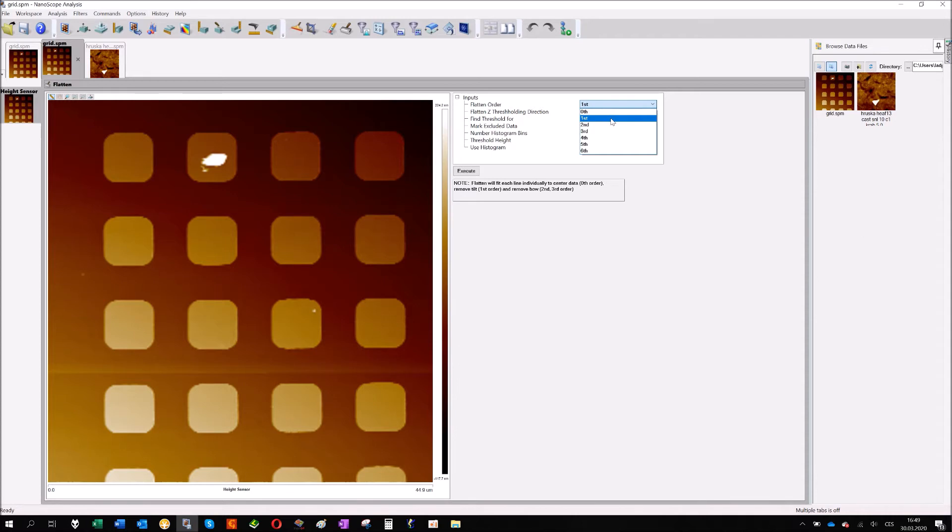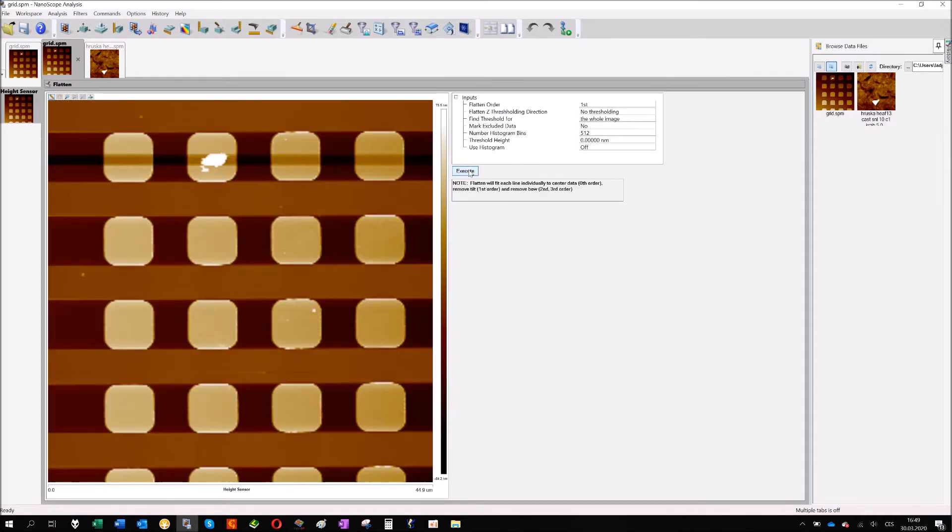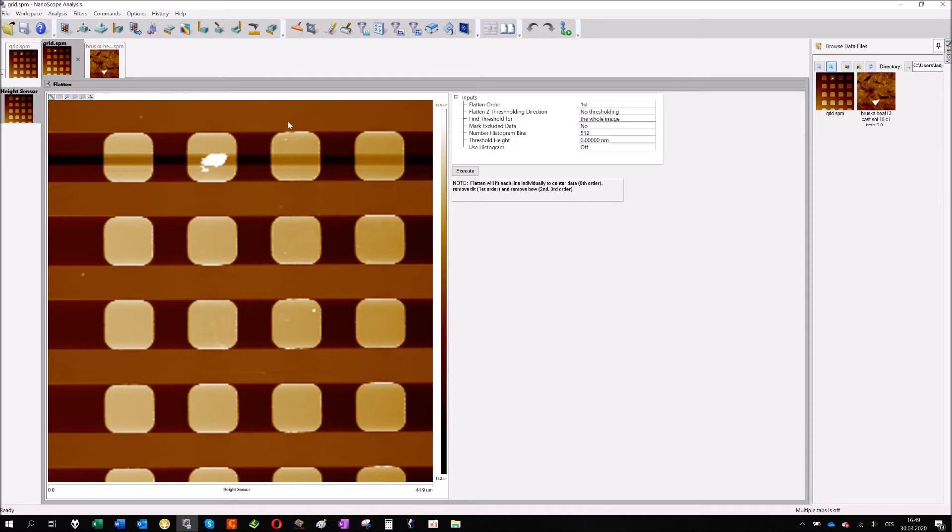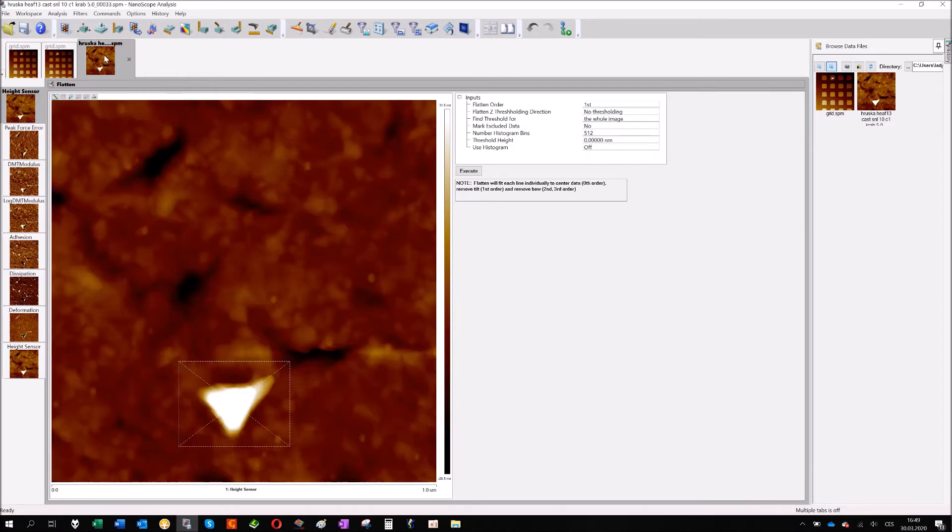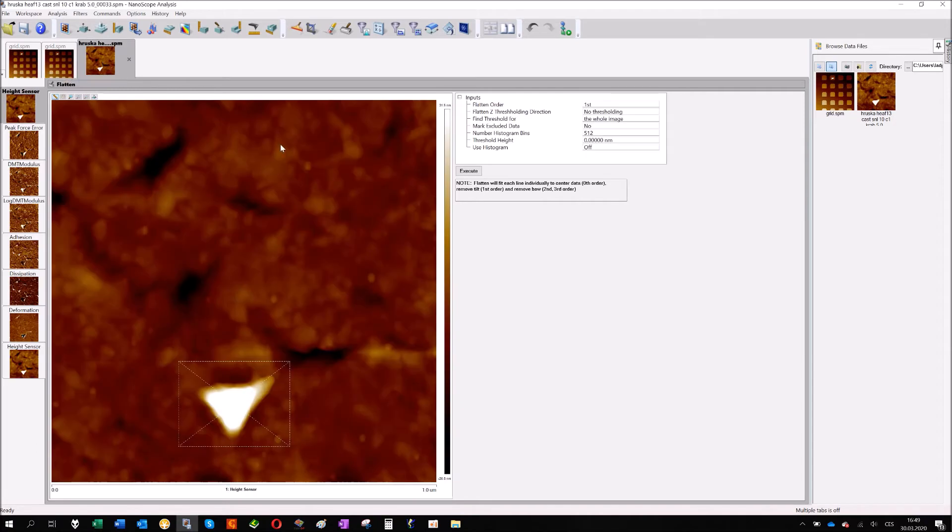So that's about the orders. Let's do it. I will choose the first one. We will ignore the rest of the parameters for now and just click execute. You can see that the topography is already flattened, but it doesn't work for the high features. I will show you on some real sample. This is just the standard calibration grid.